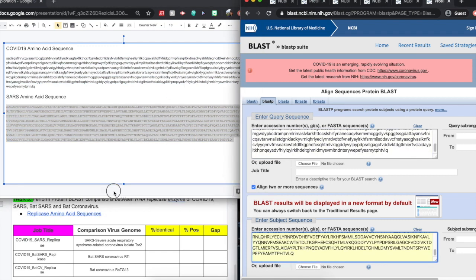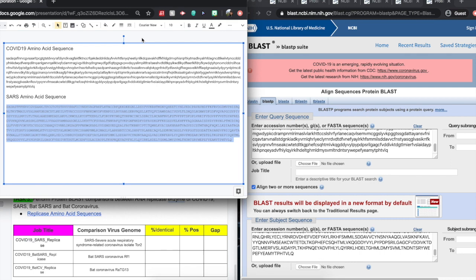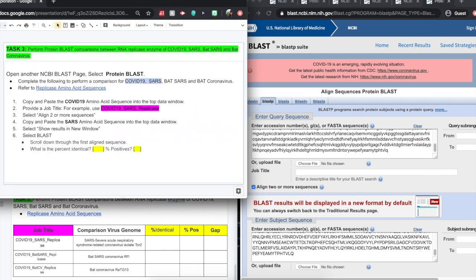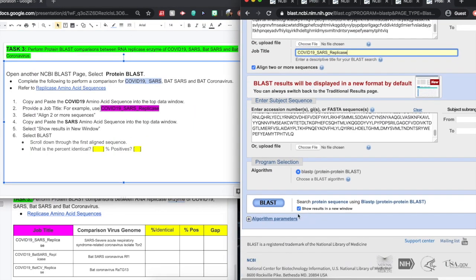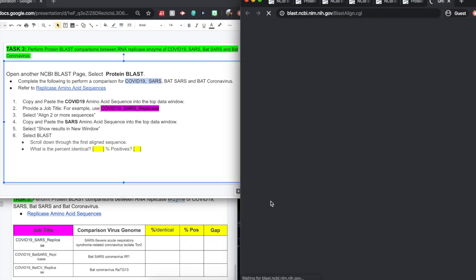We will copy and paste the SARS amino acid sequence. Now, we can't forget our job title, so we'll have to go back and scoop that up. And we want to make sure that this will show up in a new window.